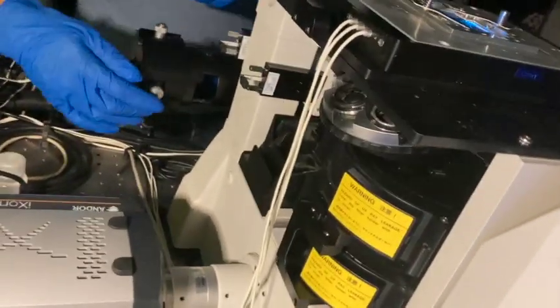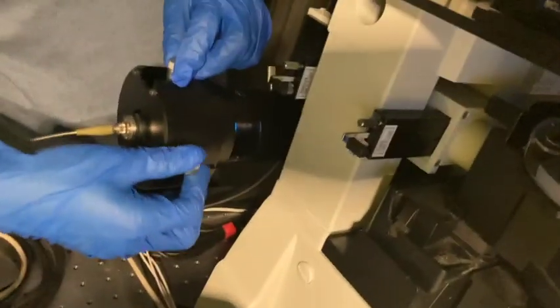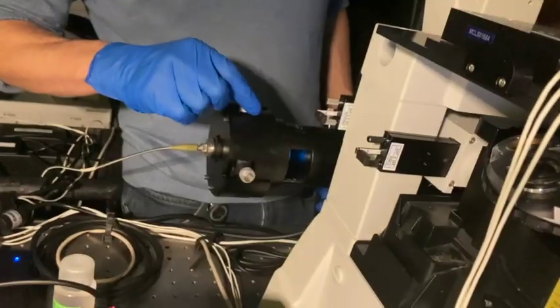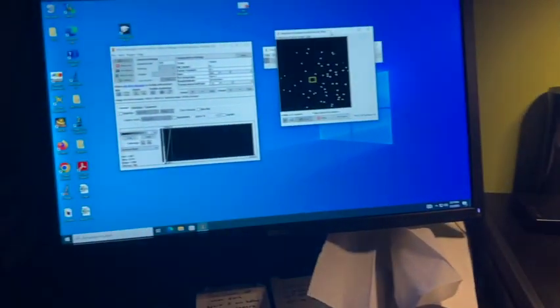So yeah, these two, can you see it in the camera? Yeah. So let's try it again. I forgot this one. Yep. This one is changing the angle, going up and down, and this one adjusts in a different direction. But we mostly change this line going down, and then let's see how it changes the curve.